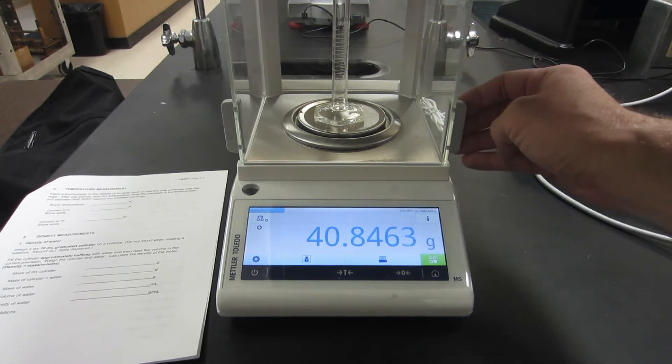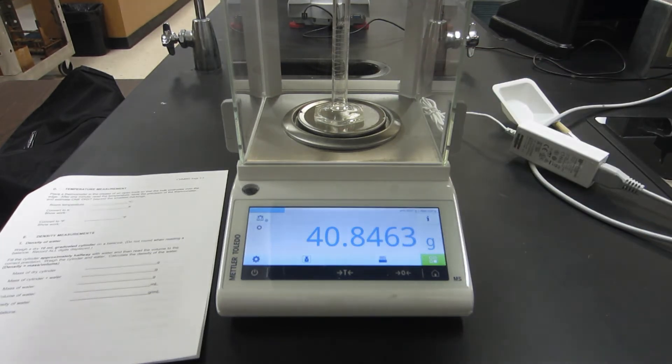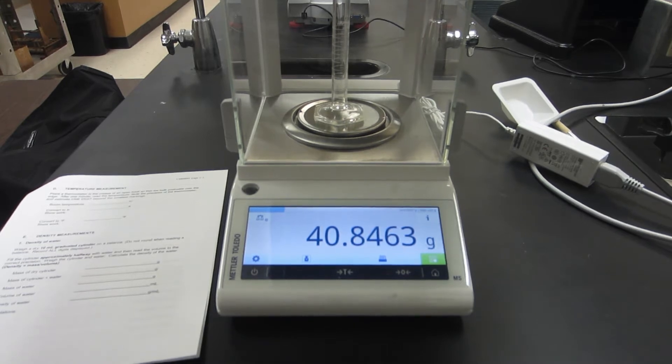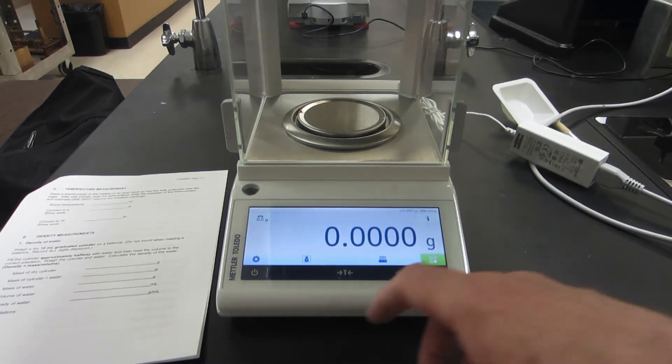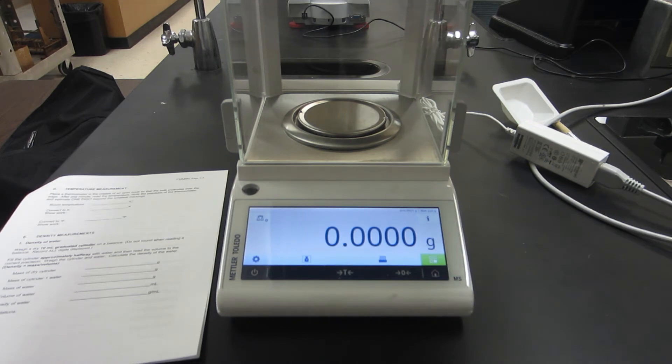Make sure you close all the doors on the balance, and there we go. There's the mass of the empty graduated cylinder, so you can record that on your report sheet.